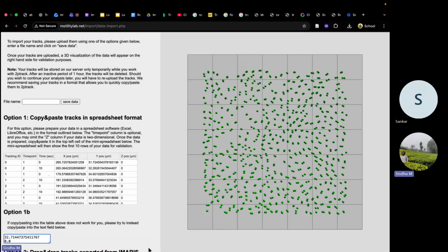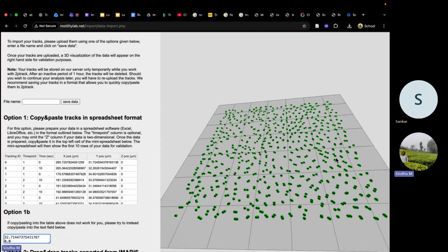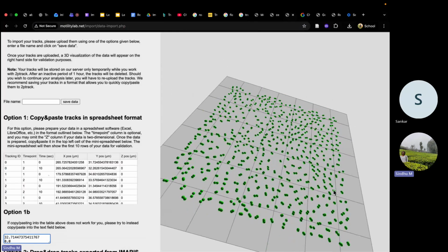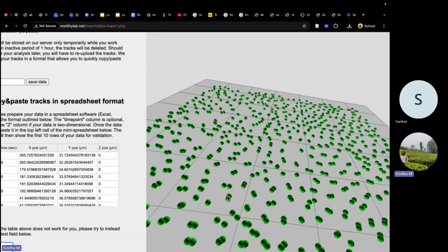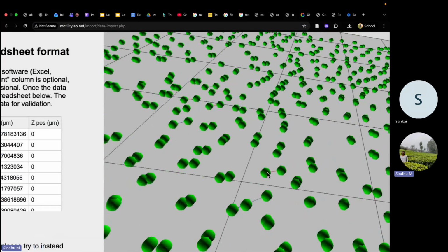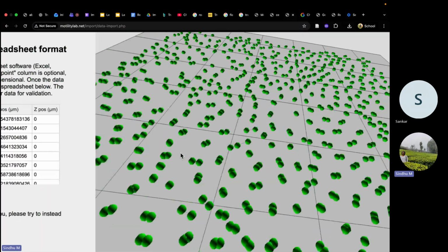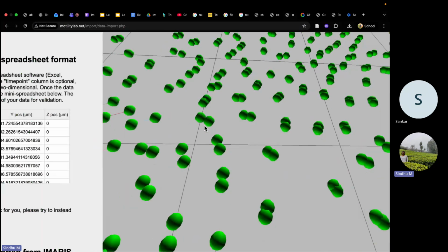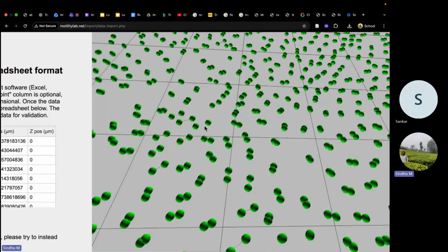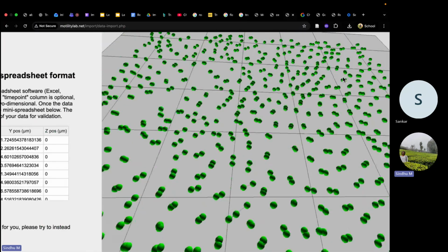Okay. So I've just pasted everything here, and now, in our case, the particles are in 2D, so it has just plotted the particles. So you can see that there are two. So this is the particle at time 1, and this is the particle at time 2. And here it has plotted each of the cells just as a dot of the centroid. That's why it looks much closer and much smaller compared to the original data set we have.